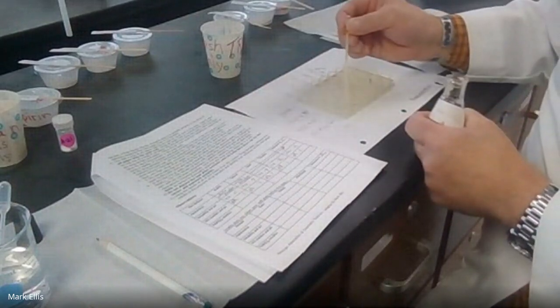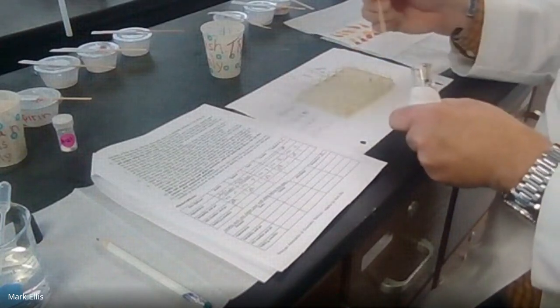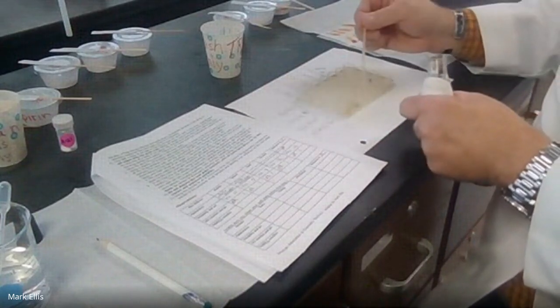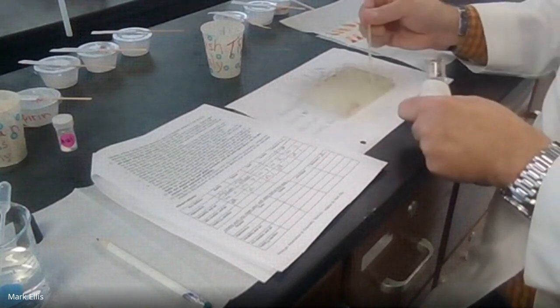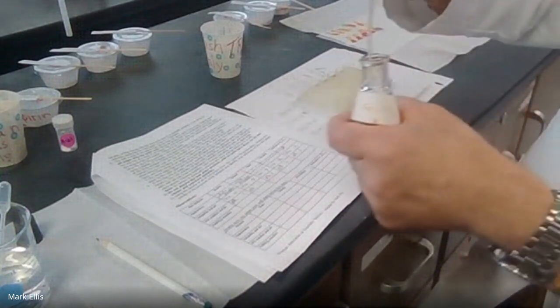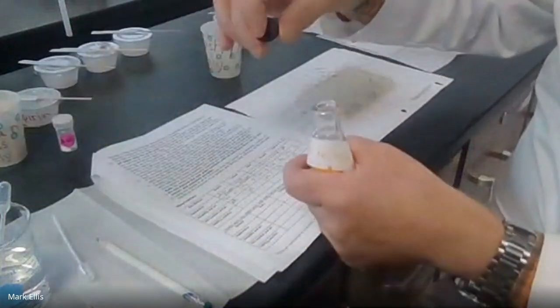So 1, 2, 3, 4, 5, 6, that's okay. 1, 2, 3, 4, 5, 6. Ooh, see a reaction there. 1, 2, 3, 4, 5, 6. Oops, I should have noticed. 1, 2, 3, 4, 5. And my unknown, 1, 2, 3, 4, 5. Okay, I'm going to squirt out what's left and lay the dropper down, put the cap back on.